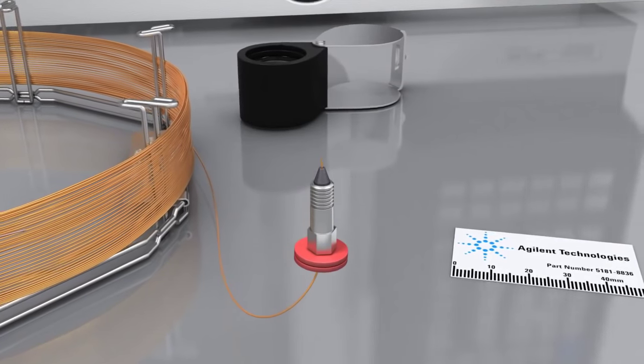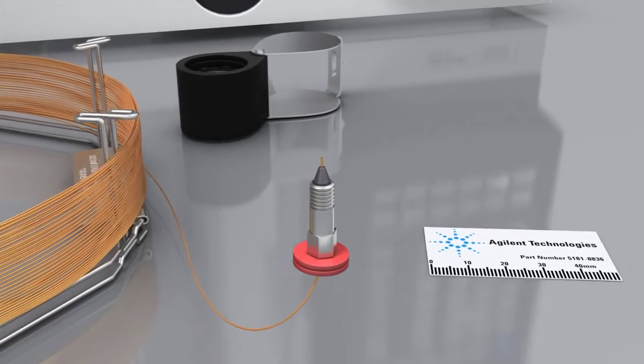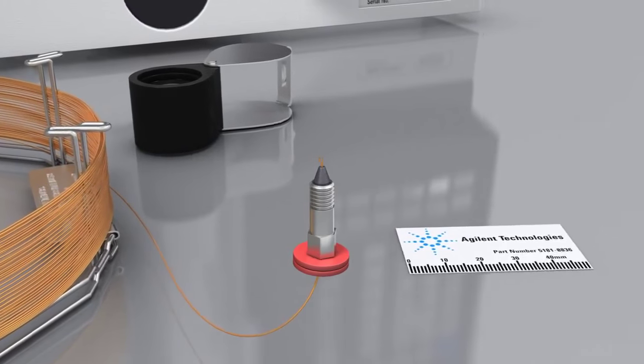Graphite polyamide blend ferrules are very popular but are known to leak after temperature cycles due to ferrule shrinkage.